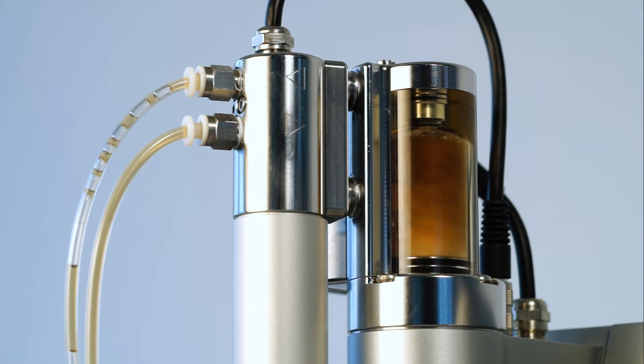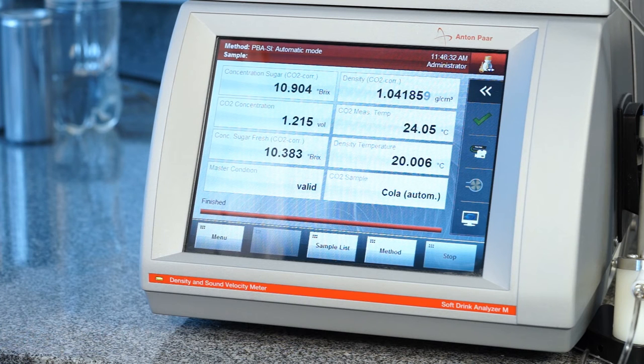While density, brix, pH, and dissolved oxygen are measured simultaneously. After 3-5 minutes, the entire measuring cycle is completed.